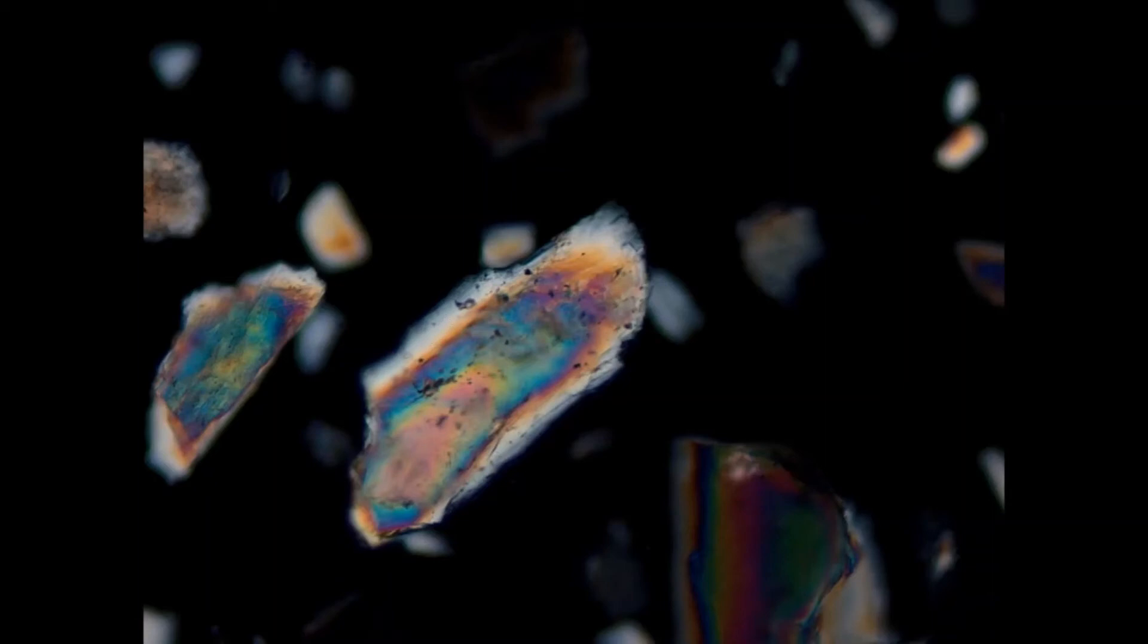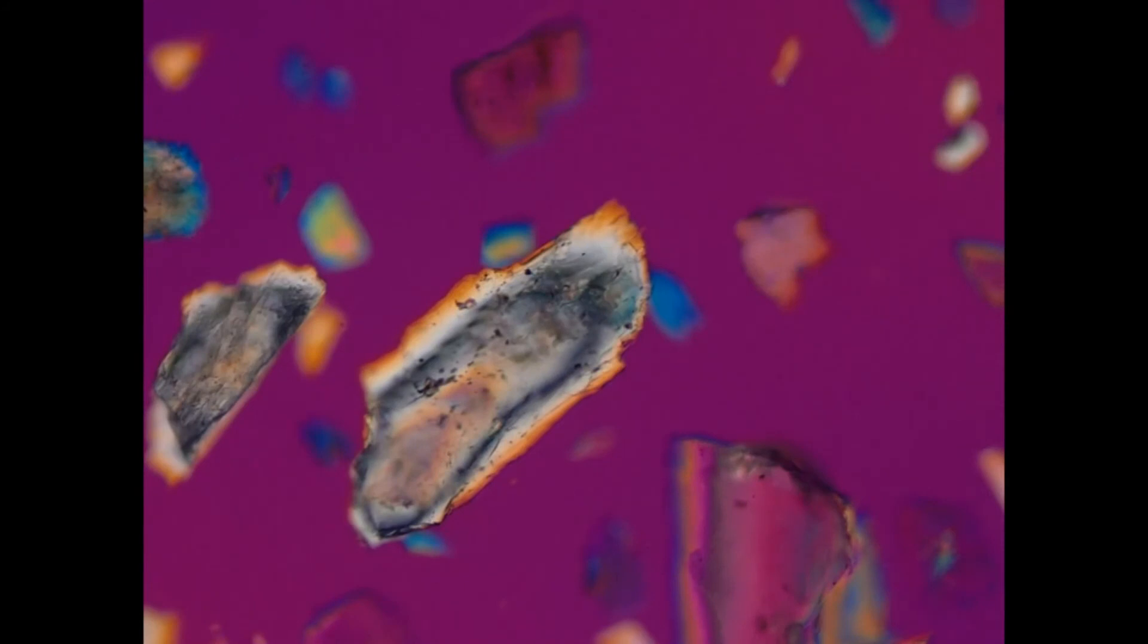If we put in our accessory plate, we can see that these colors change to orange or yellow of the first order, which means that the grain has negative elongation.